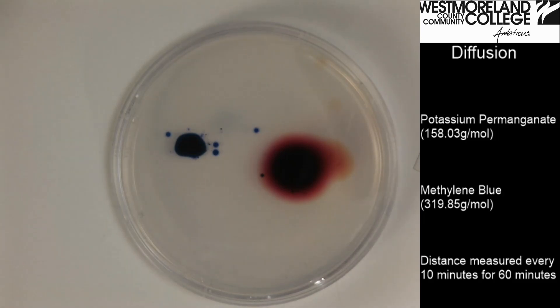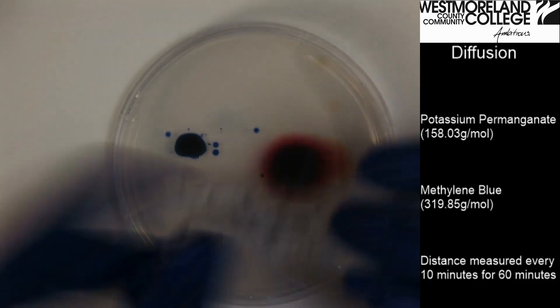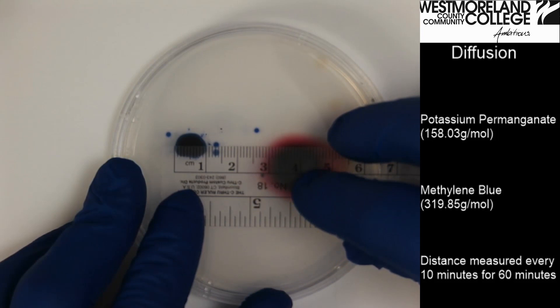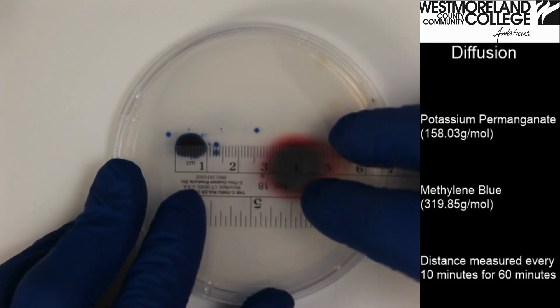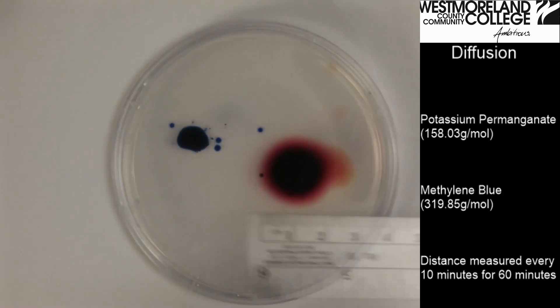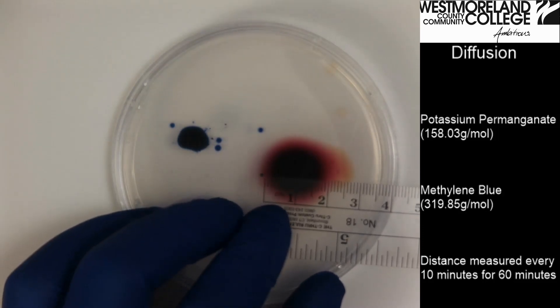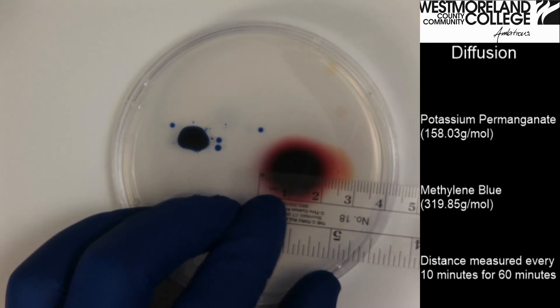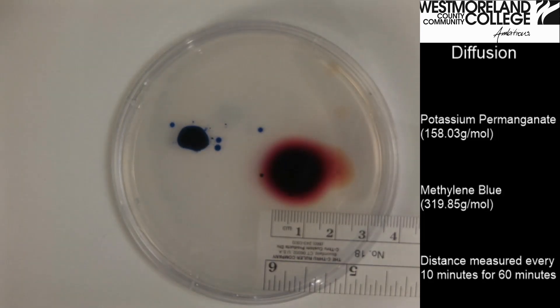It has been ten more minutes and I will take another measurement. The methylene blue still looks like it's right around ten millimeters. The potassium permanganate may be up to 22 millimeters. I'll wait ten more minutes and then that will be our final reading.